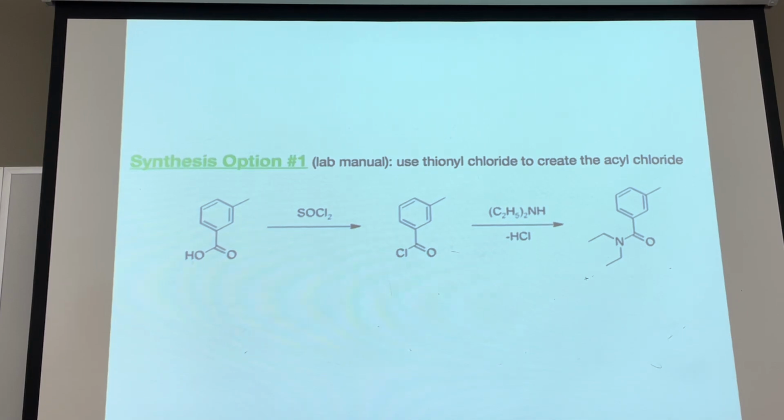The thionyl chloride will start leaking out of a syringe, and that's the last thing we want being strewn across the lab. Number two, because you are going to be taking this back to your bench, it's a lot safer to have people walking around with capped syringes. I will never forget the first time I did this experiment.